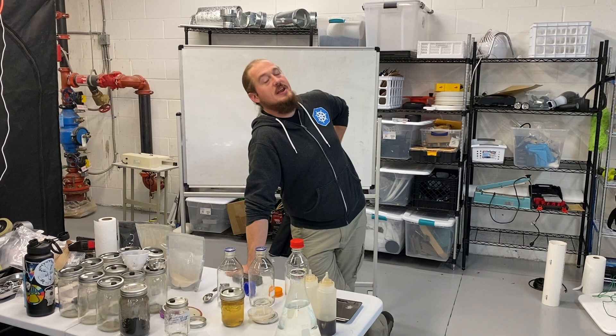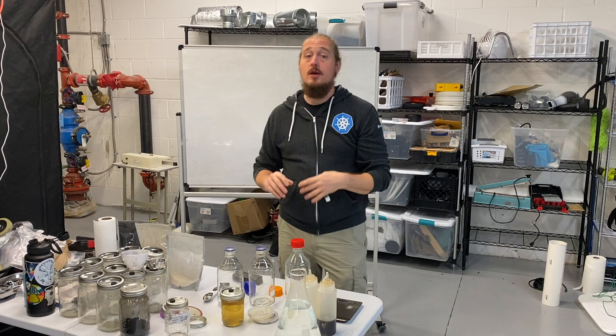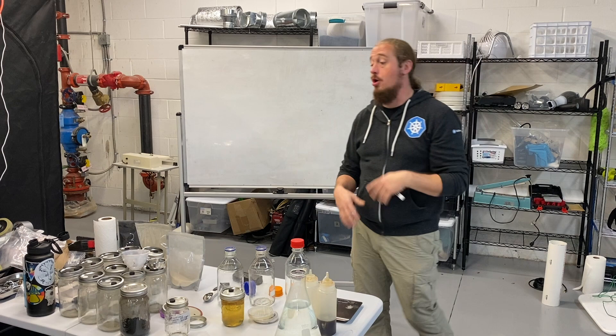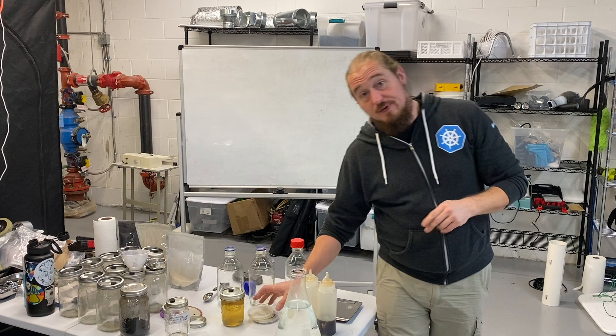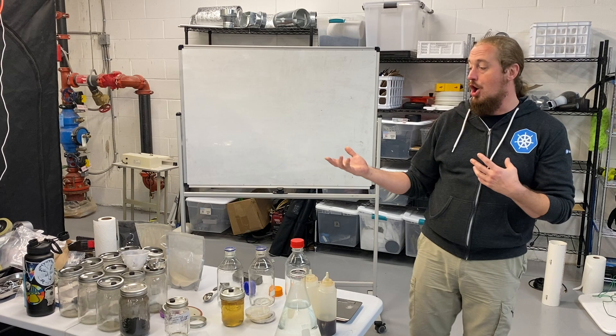Welcome back, Jesse here. This is video two in the agar series, and again we're starting the series from the basics — what is agar, what are agar plates, what are liquid cultures, what do you use them for? Here in video two I'm going to be covering a bunch of recipes. I'm going to try to keep this short because a lot of this information is just permutations on a very basic recipe.